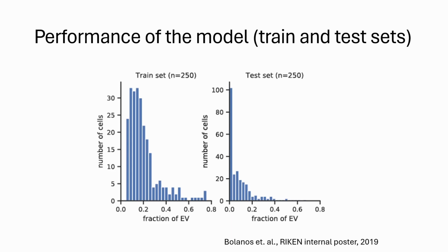And so over here, I have the test set data as the performance of the model. What I'm using to measure that is something called explained variance. If you have a perfect model, you have 100%, like 1.0, of explained variance. But in this case, even in the test set, I have some cells that have maybe 40% explained variance, maybe some around 50-something percent.